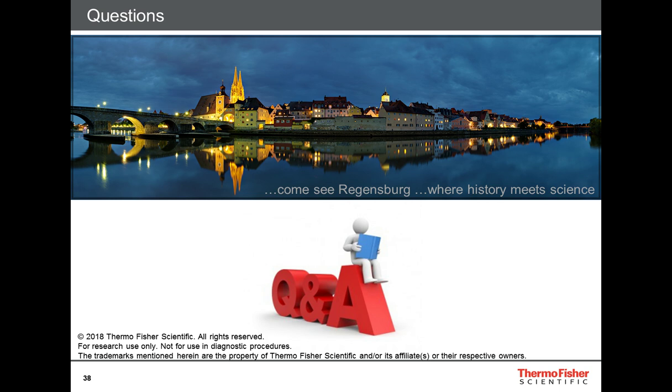This is kind of a showcase, but we have done these studies for other proteins as well, and we see maybe not that extreme, but very similar results. So you can make that experiment on your own. You can go to different vendors and do the optimization on their website and see the results. You can hit the optimize button several times, and from some vendors with their algorithm, you will see that every time the sequence will be different when you optimize it. So it's a stochastic algorithm. That's one thing that would make me suspicious.